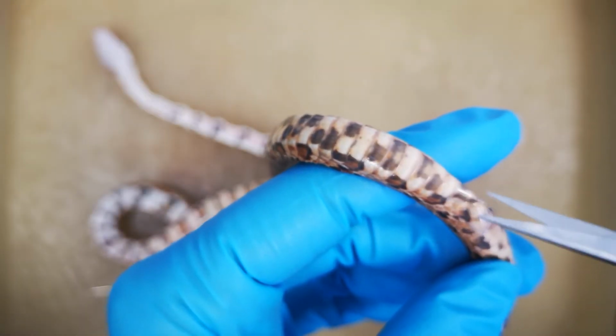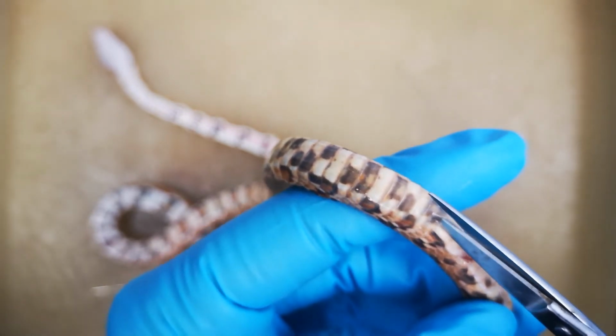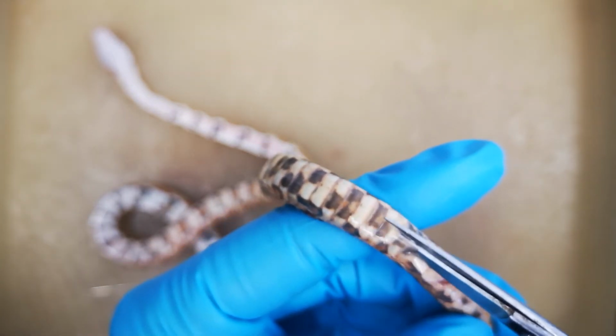To begin the dissection, we make a transverse incision just anterior to the cloaca, and then run a sagittal incision up to the neck.